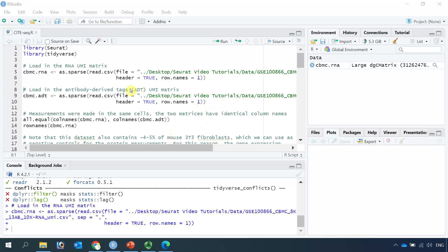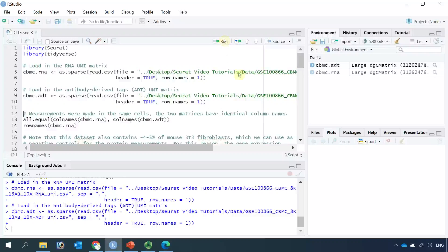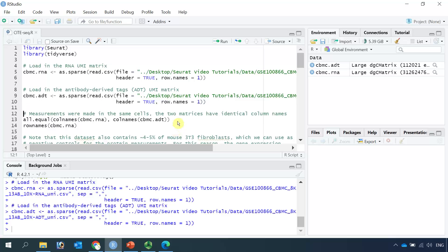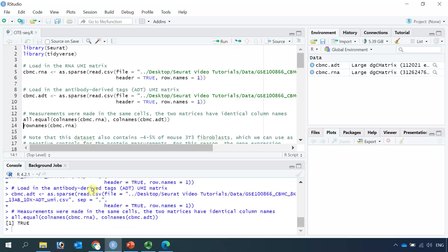Next, we read the ADT matrix data in. You can see here we have the ADT data, and it is also a large dgCMatrix. Both datasets should have identical column names. We can use this code to check if the column names are the same — the column names are barcodes. Let's run this code. You can see we got a result of TRUE.